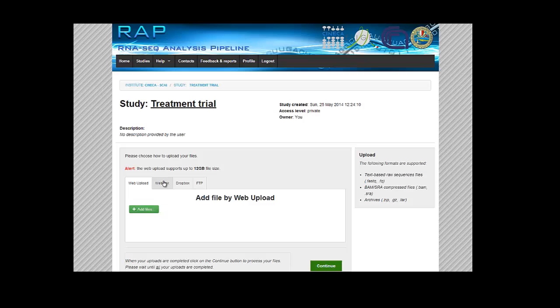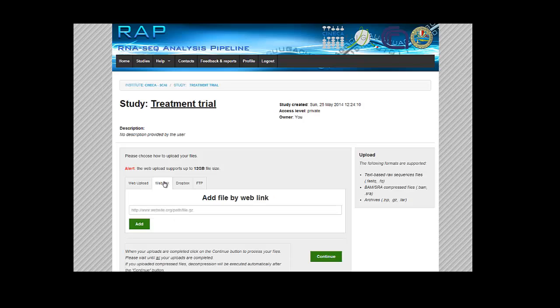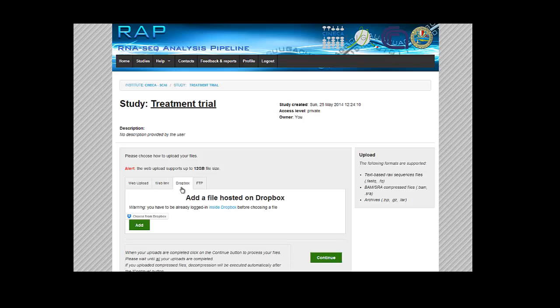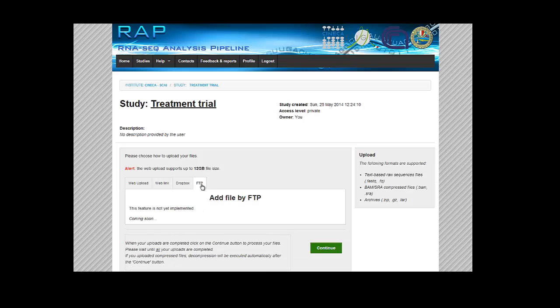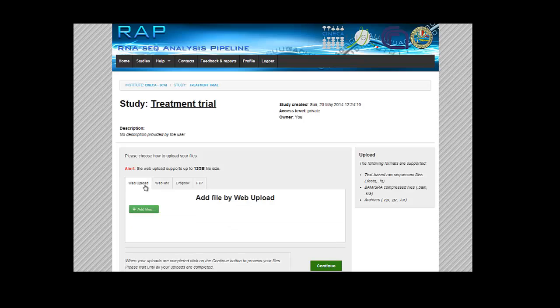Or you can enter the URL of a file accessible from the web, or even a Dropbox link or Box link. And we're going to implement the FTP connection very soon.